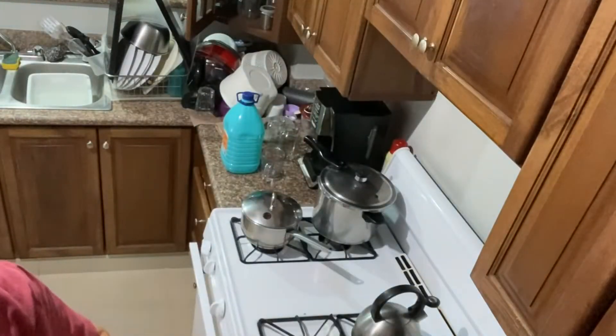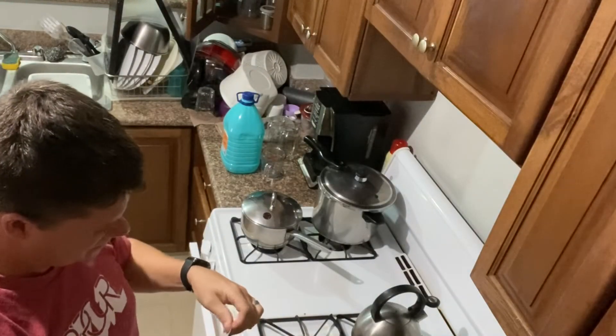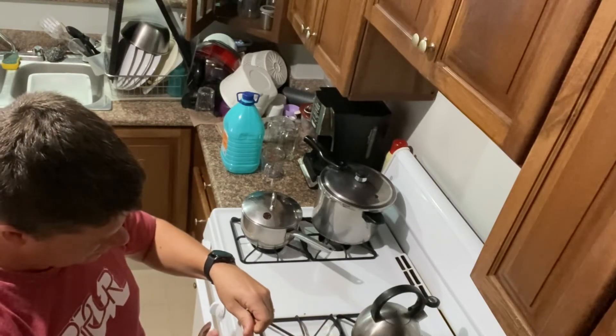After it was boiling, I took the powder that I bought from eBay or Amazon — I can't remember — opened it up, divided it in half, and added it to the pot.